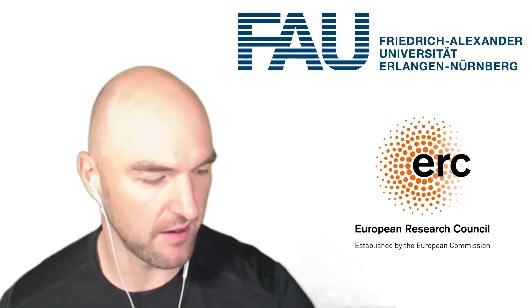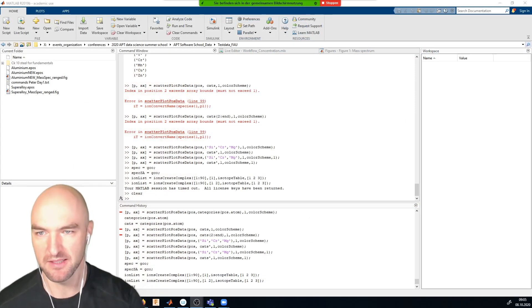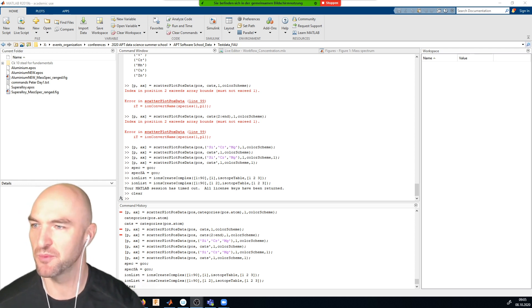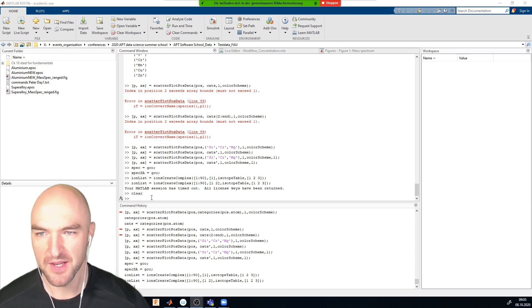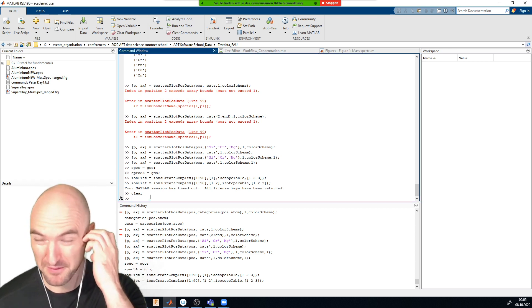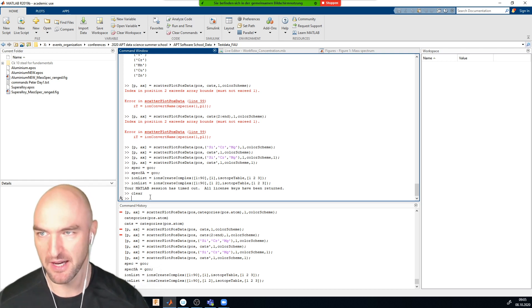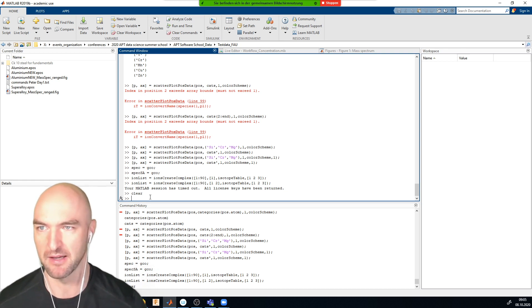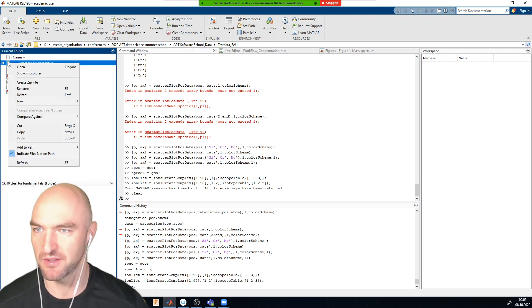Before we start today with the visualization, I just want to revisit something we discussed yesterday. One thing that was perhaps left out in Andy's discussion is detector pileups. I want to show you what I mean by that and what implications detector pileups have. I have a data set here just to demonstrate.